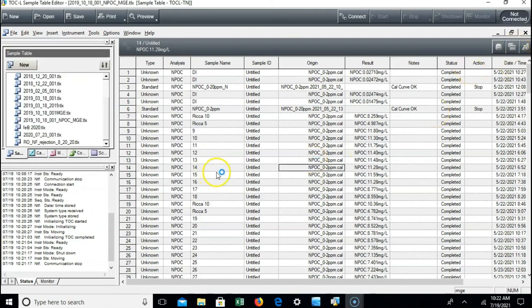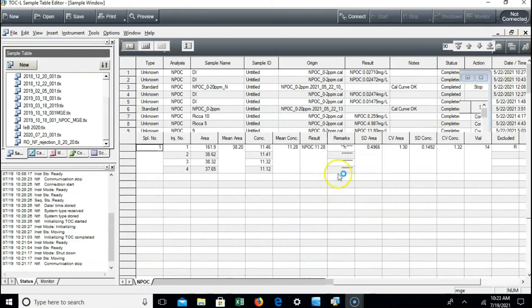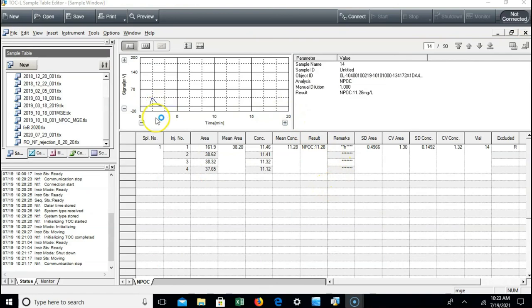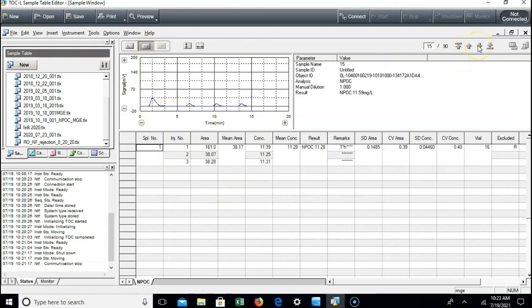If you click on the button that looks like little peaks, you can look at the details for each individual sample and injection. It'll tell you how many injections it took, what each injection looked like in regards to the area under the curve and the corresponding concentration, and if there were any issues with that injection.